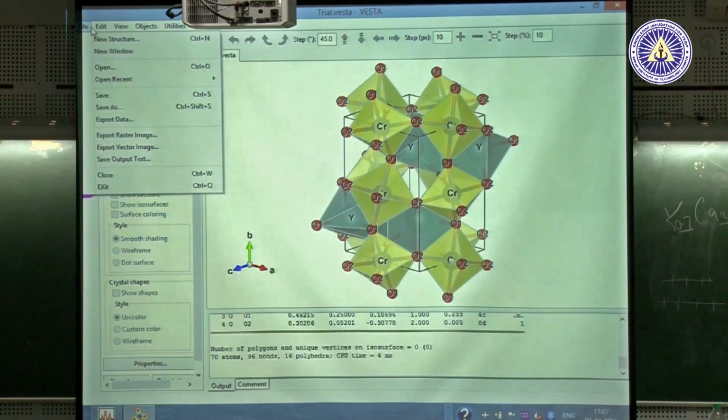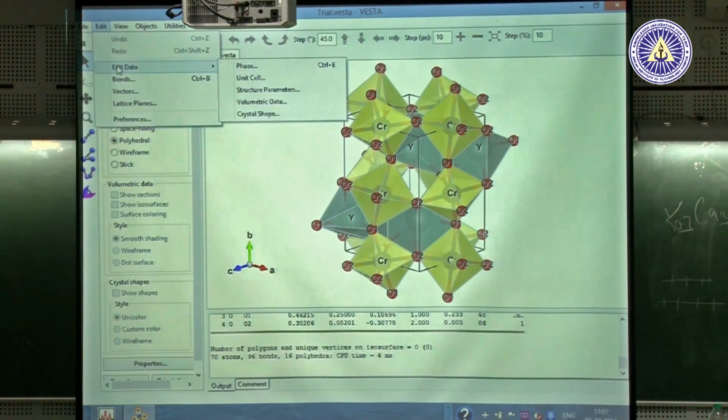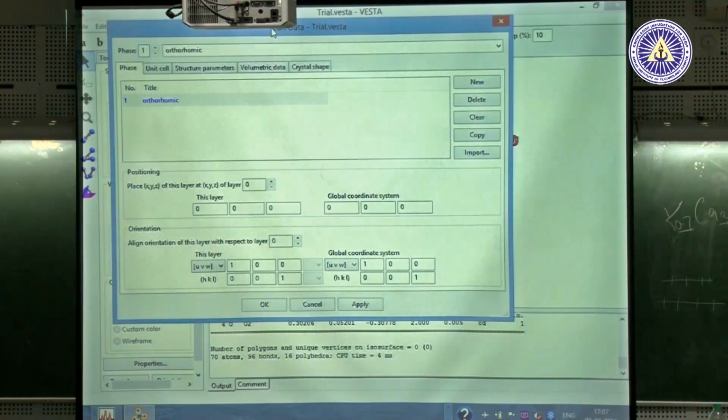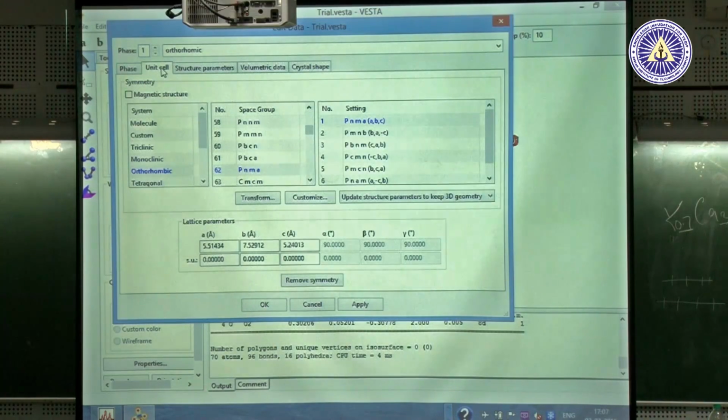Don't forget the picture. Oh, sorry, forget the picture. No, but it's beautiful. Oh no, it will keep in your mind, but before that, see how it comes. Put the structure name here, unit cell. It's a new version of the software. It looks the same as CrystalMaker. So I don't know, I didn't see.